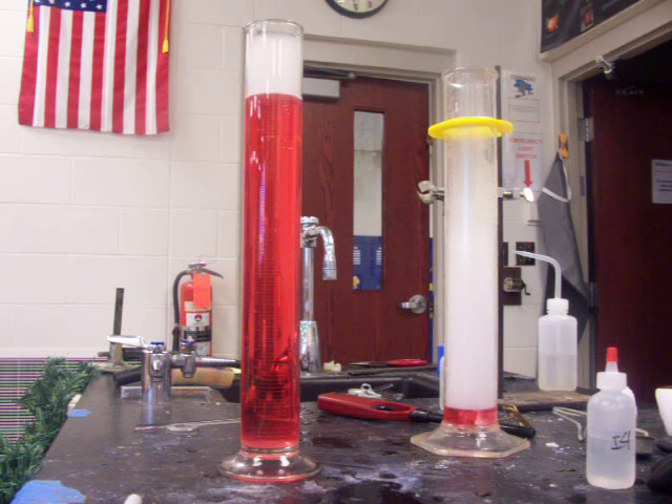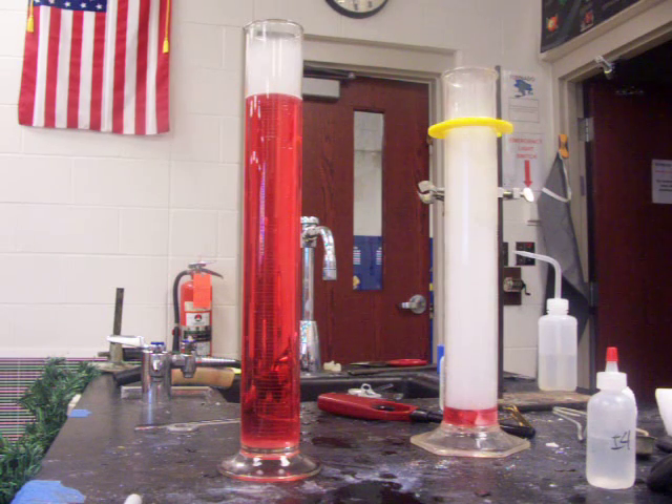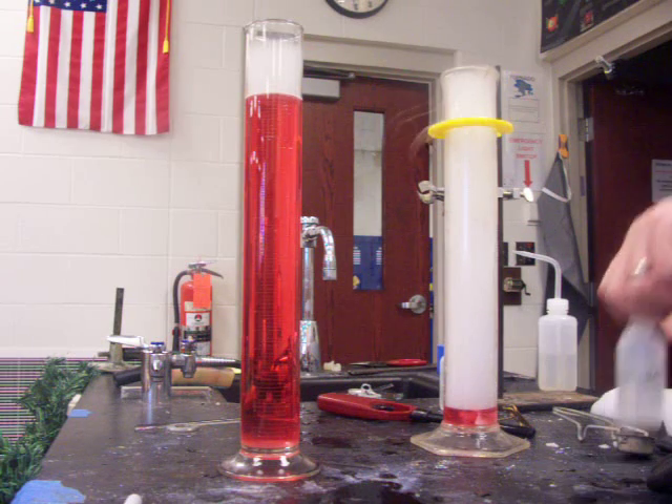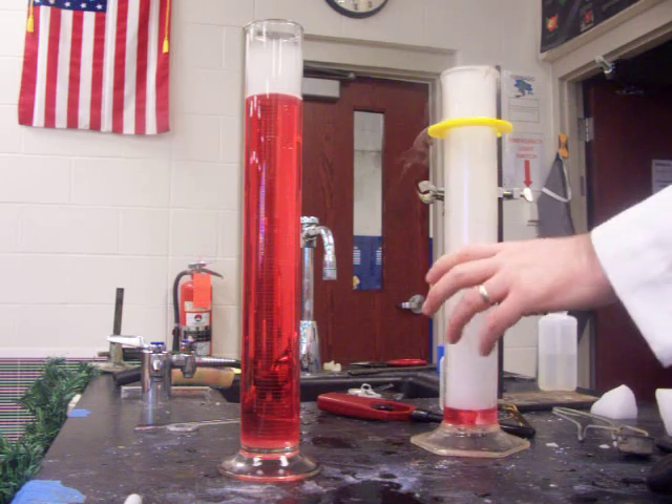We have water with acid added and universal indicator, which gives us the red ring. I'm going to add some base back to it, and it's going to take quite a bit I suspect, but we're going to try to push it back into the basic region.